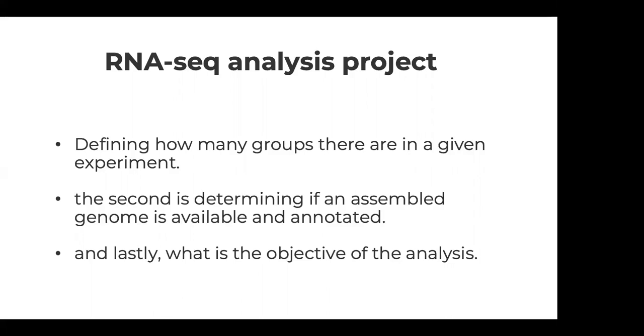Defining groups typically starts by looking at the conditions. Sometimes, for example, it could be treated versus controls. For example, someone who has been treated with a drug versus someone who has not been treated with a drug. So these are two different groups, right? As a result of the condition or groups, we can identify different patterns. So that is another important objective.